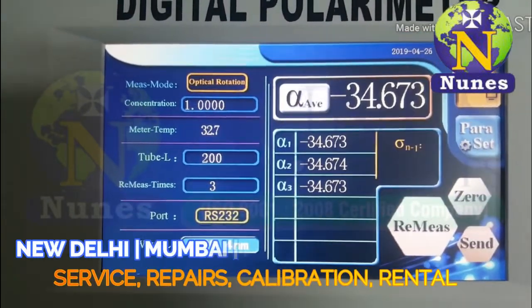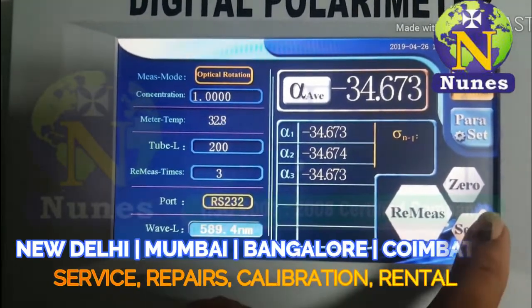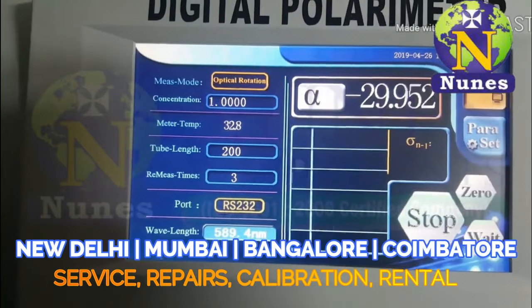If you want to take the average reading again or remeasure the value, press remeasure. The same sample remeasuring process will begin.